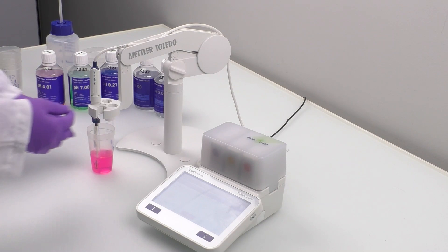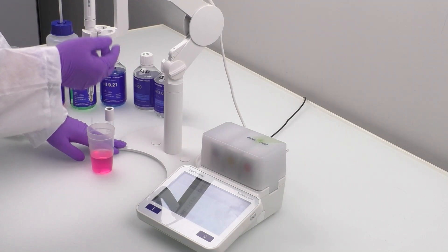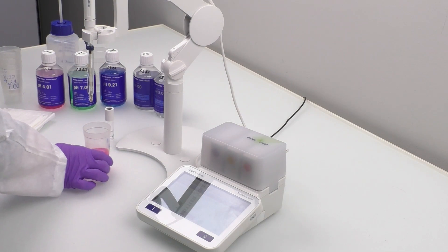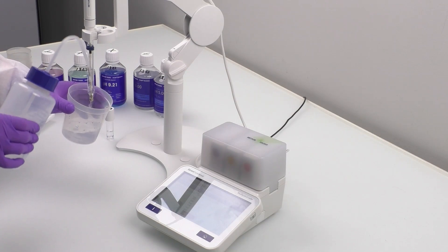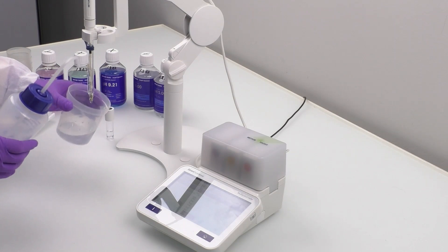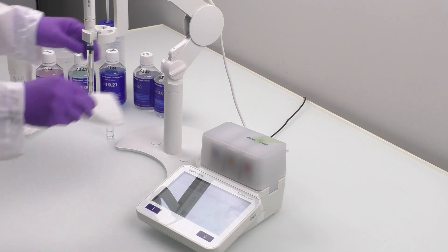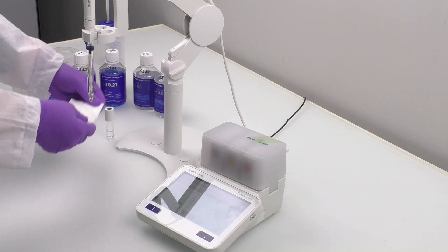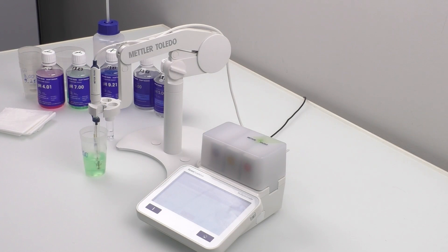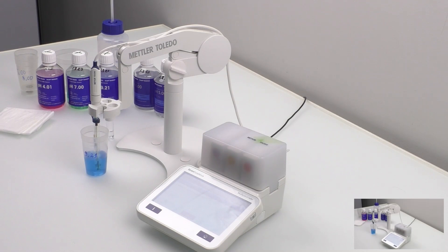Now, it's time to remove the pH buffer 4.01 beaker and rinse the sensor carefully with deionized water. Remember to carefully dab it dry with a tissue. Repeat this calibration process with the pH buffers 7.00 and 9.21.